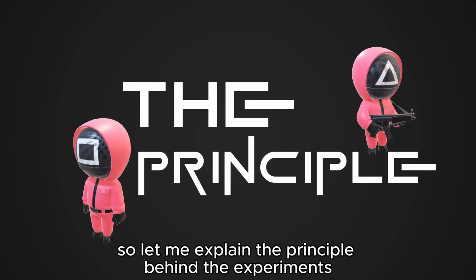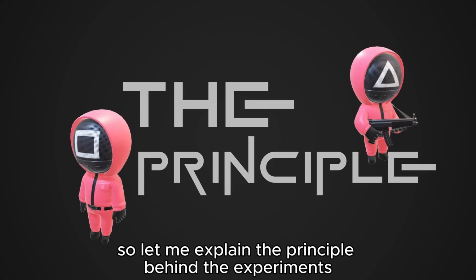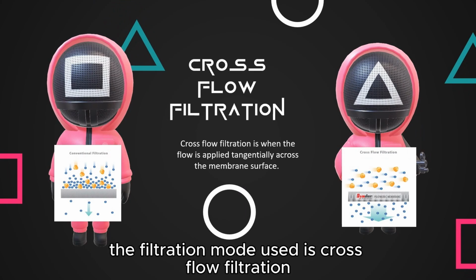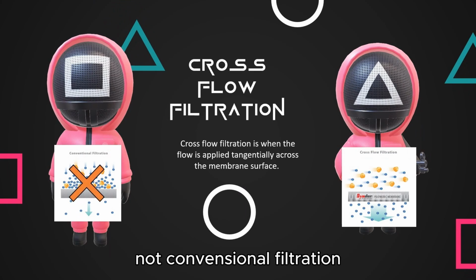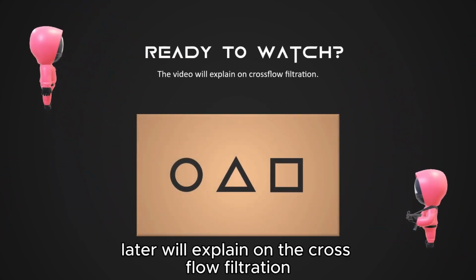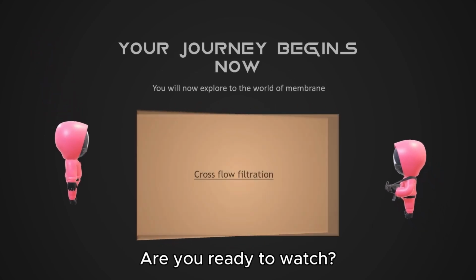So let me explain the principle behind the experiments. Actually, in membrane-based separation techniques, the filtration mode used is cross-flow filtration, not conventional filtration. So, the video that we will play later will explain cross-flow filtration. Are you ready to watch?